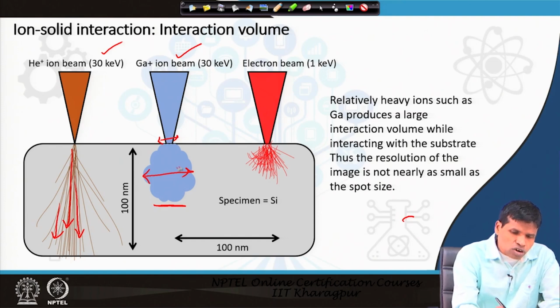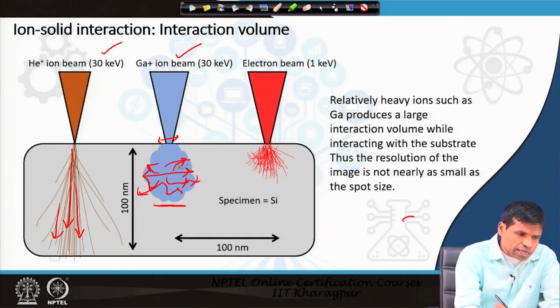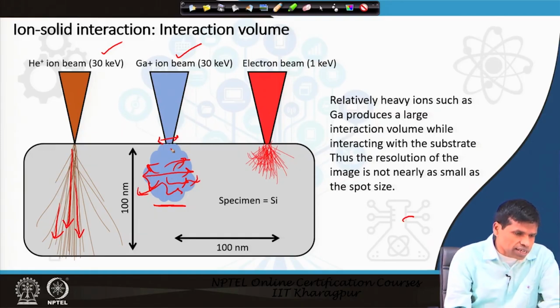It has much of the recoil effects. Gallium will recoil with other atoms and it will keep on moving here and there in the lateral direction more, producing signals from a larger area.